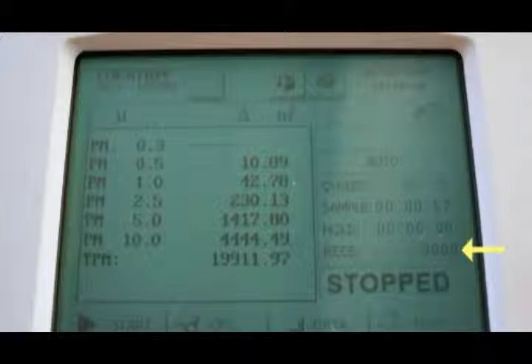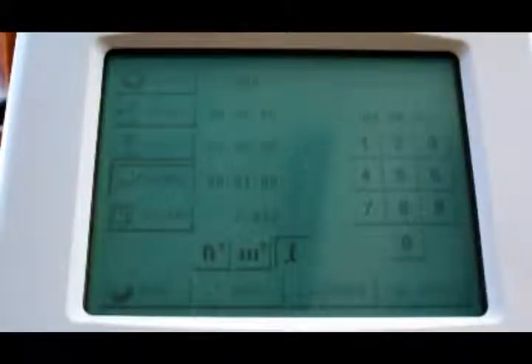If it goes over 3,000, it starts erasing points from the beginning. When sampling continuously for long periods of time, make sure that your averaging interval and sample length work together in such a way that you will not exceed the 3,000 point maximum. The 1 minute interval, for example, works well for sampling events up to about 48 hours, producing 2,880 recorded data points. If you want a longer sampling event, make sure your interval is larger so less points are collected.